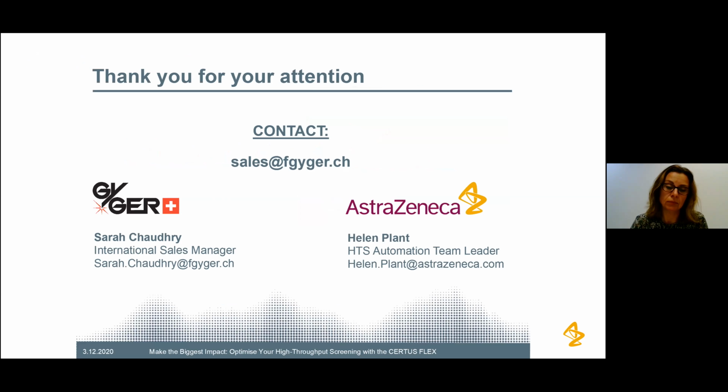The first question is from a friend of everyone's, Nicholas at Galapagos. He's asking, do you apply the correction factor for all types of solutions, and how much time does it take?